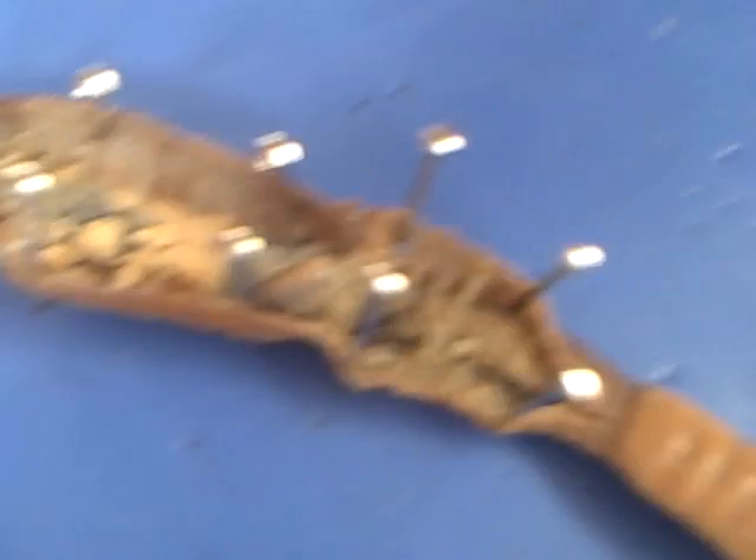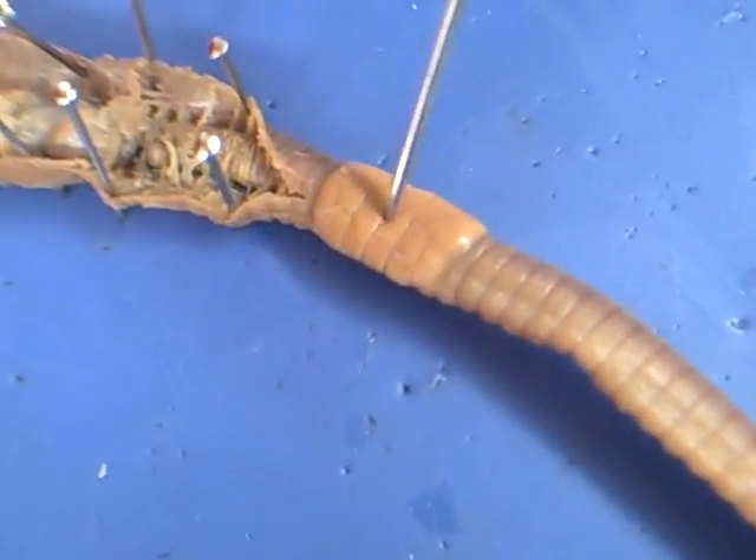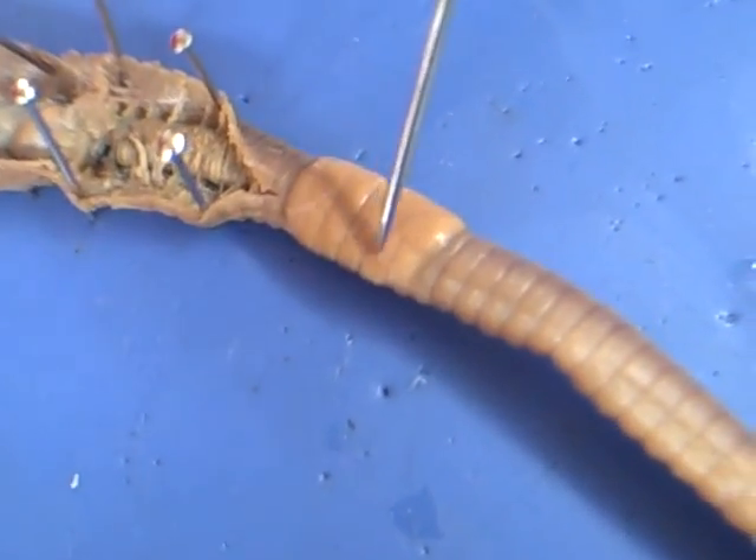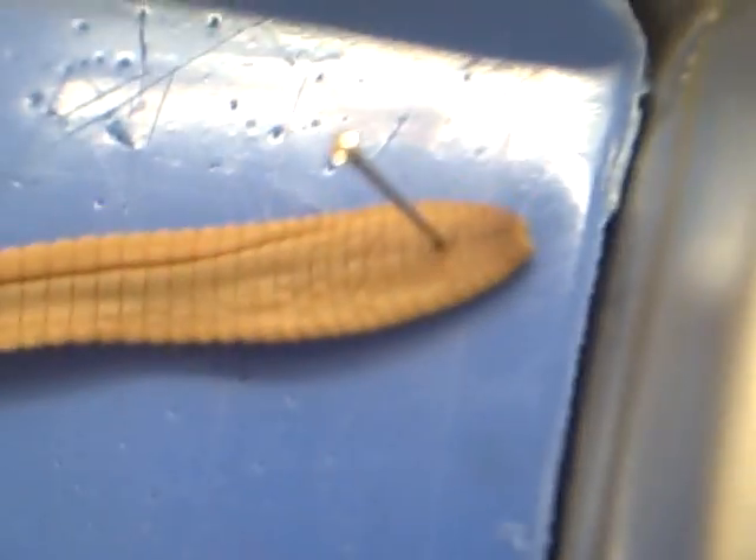And this is the clitellum, or whatever you call it. Yeah, that's about it.